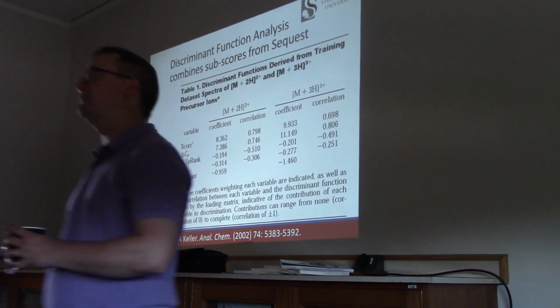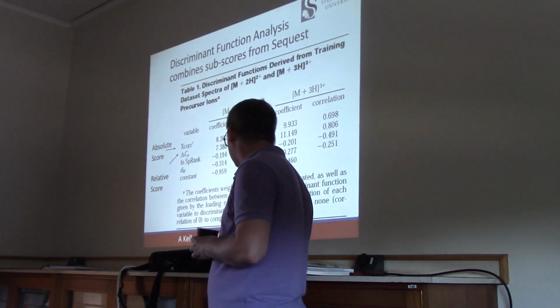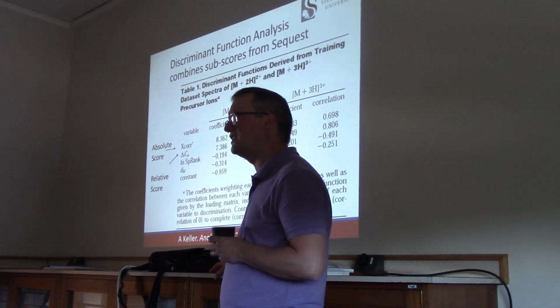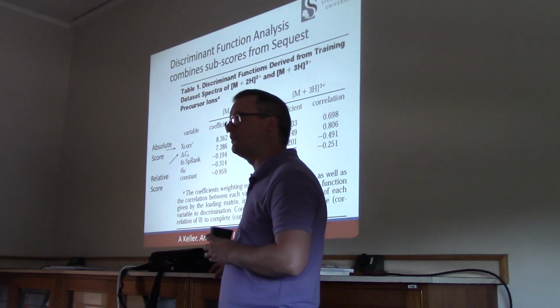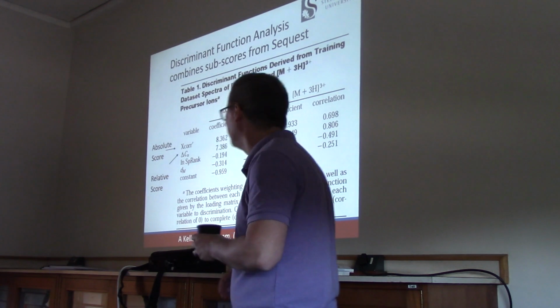So let's start with PeptideProphet. PeptideProphet was published by Keller and Nesvizhskii back in 2002. I think they were both postdocs at the time. Alexey Nesvizhskii is now a very senior professor in the space of bioinformatics for mass spectrometry, a good friend too.